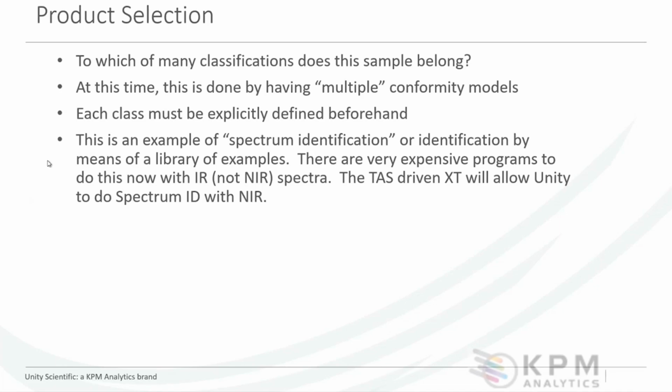There are other ways to do this, from an automated perspective. I am also interested in any customers out there or any applications doing product selection. This is something we're looking into in our product development. There are a lot of different options when you get into product selection. So if there's anybody out there that's interested in doing product selection, I would also ask them to contact me. We'd love to hear their ideas and work with them as we're integrating this into our routine analysis software.